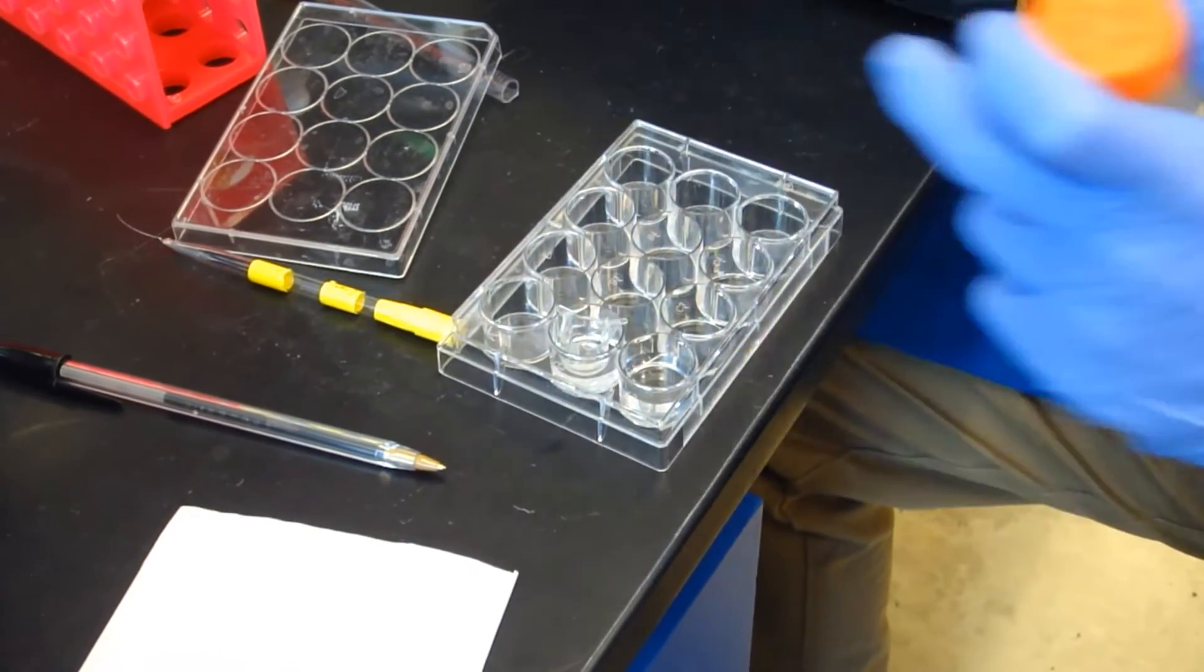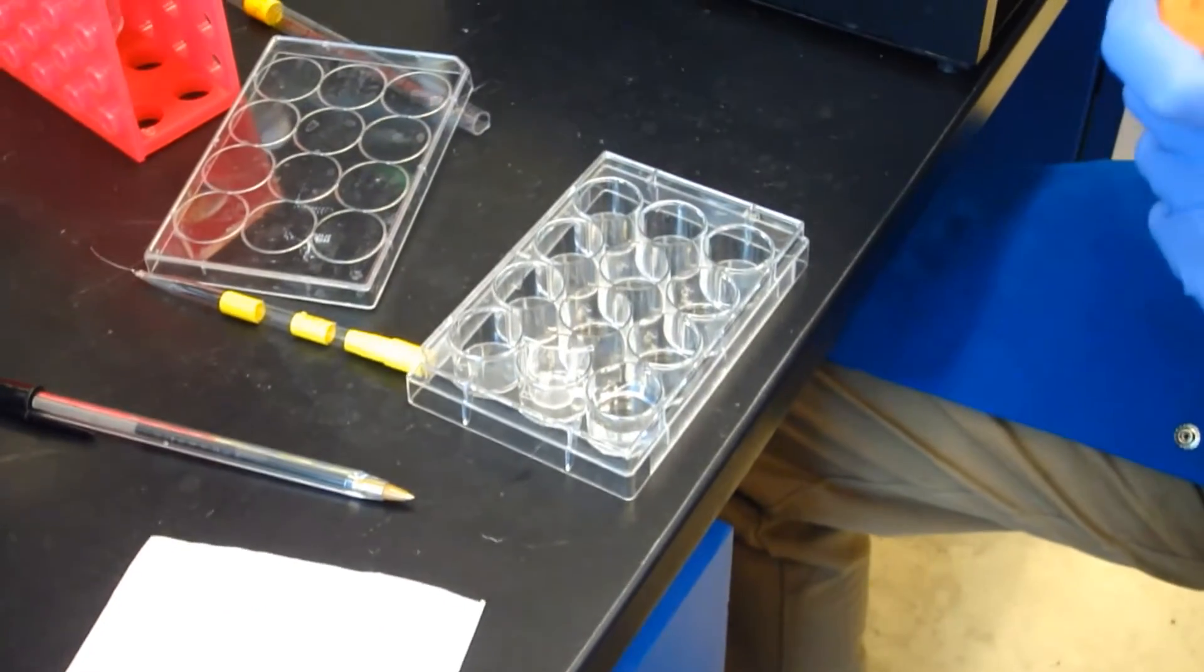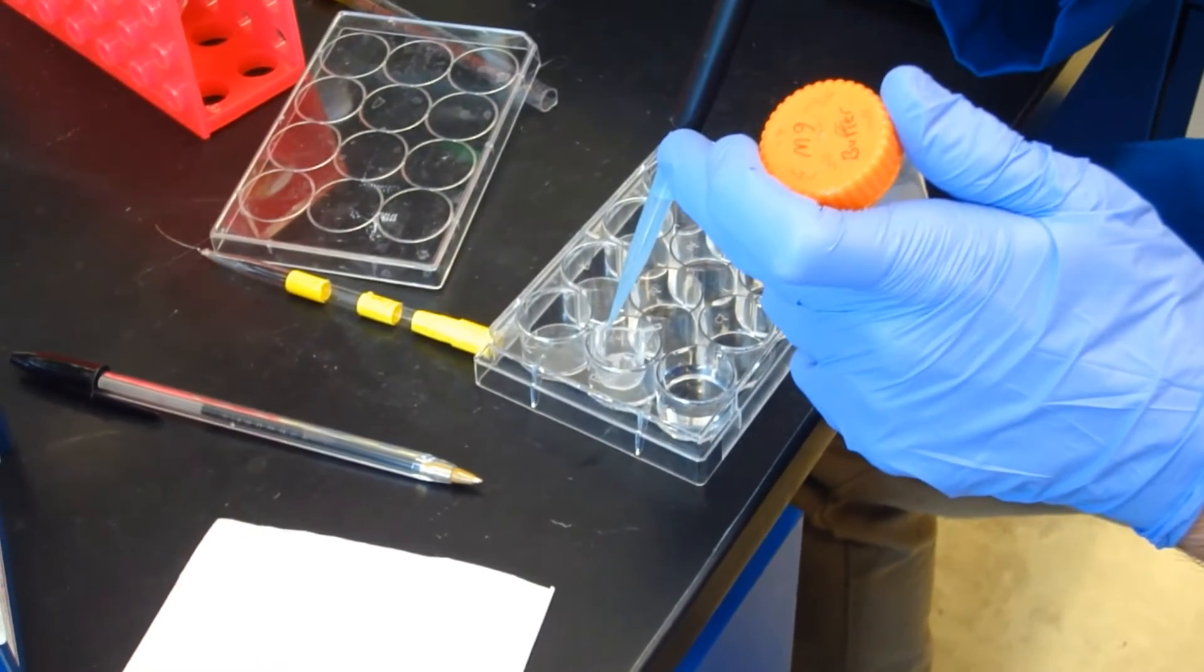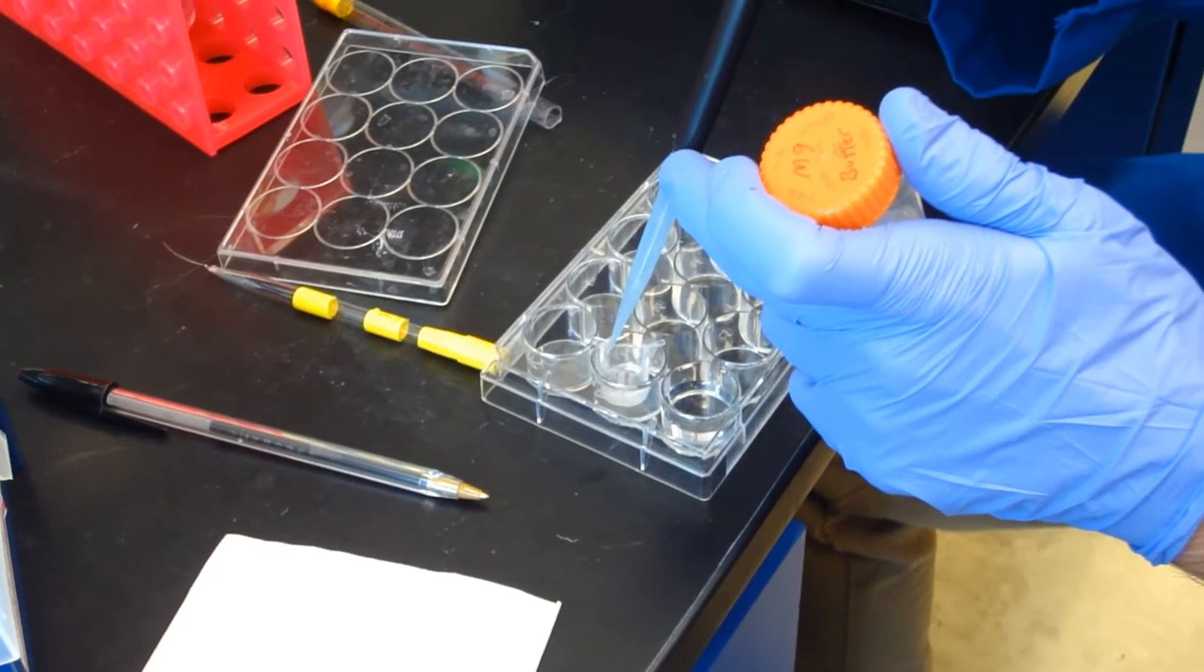So we decided to invent and build a robot that could culture the worms automatically and in much higher numbers. Robots complain less than graduate students.